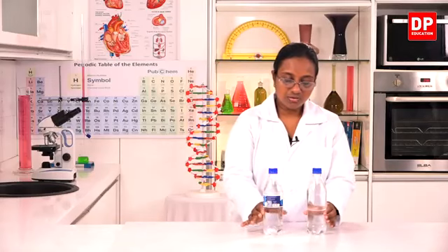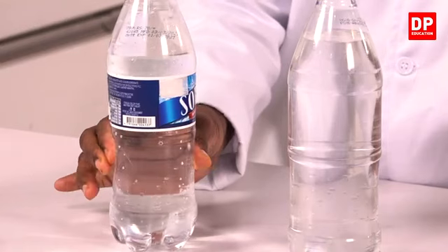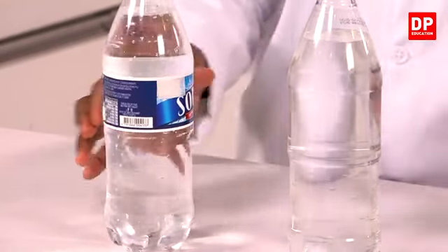Now I will squeeze both the bottles. Now you can see still I can squeeze this nicely, whereas I can squeeze this to a certain extent more than the previous instant. Earlier when it was completely sealed, I could not press it, but now I can press it. So that means the pressure has been released.